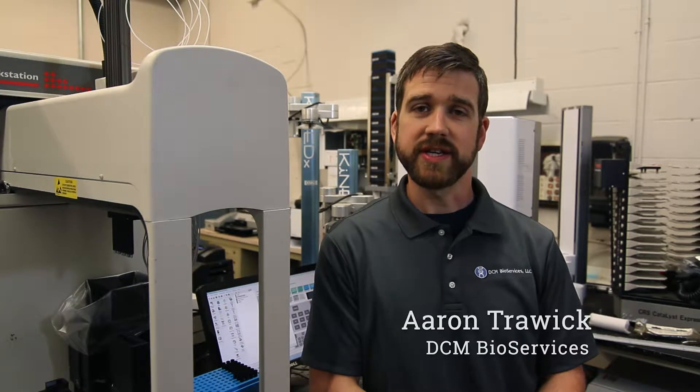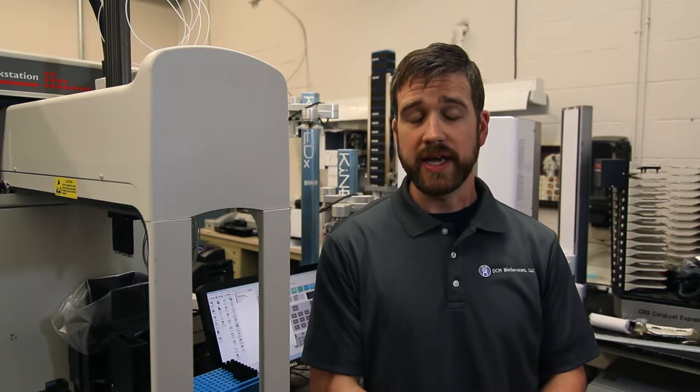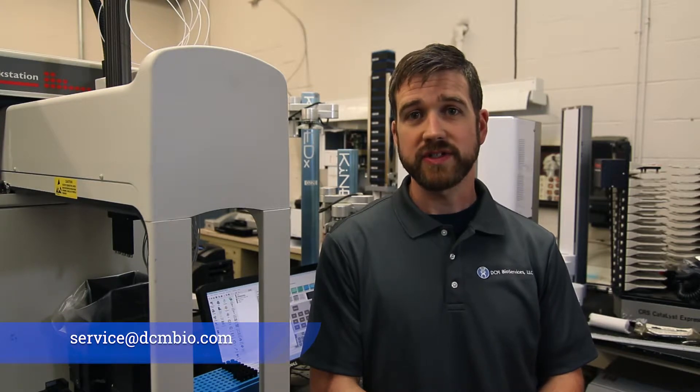Hello everyone, this is Aaron with DCM Bioservices. Today we'll be showing you how to swap the grippers on a Biomech multi-channel pod. As always, if you feel uncomfortable performing any of the steps on your own equipment, email us at service@DCMBio.com and we'll be happy to assist you.